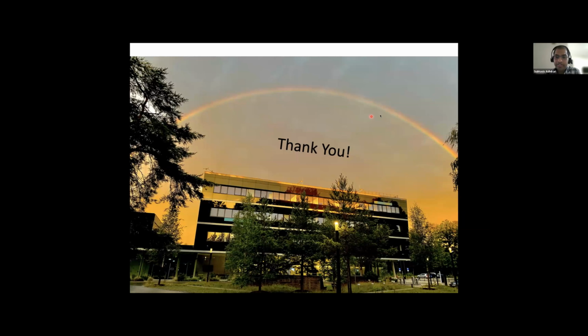Thank you. Okay, I think the last question is from Professor Kobayashi: what is the fastest frame time? In the images that we've shown you, we're imaging at a few hertz to a few tens of hertz in a typical confocal image. But again, that's something that you can choose. If you choose to scan only a very small region, you can go faster effectively. And we're limited by the scanner of our confocal microscope.